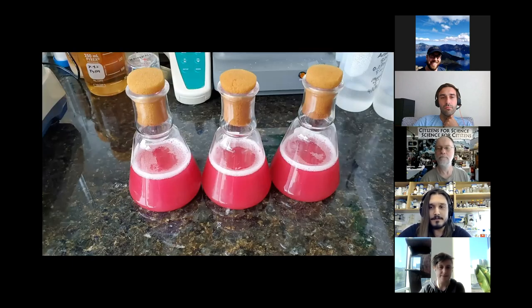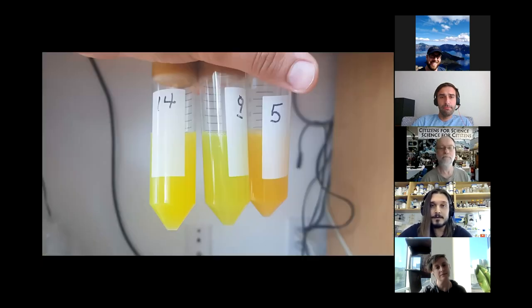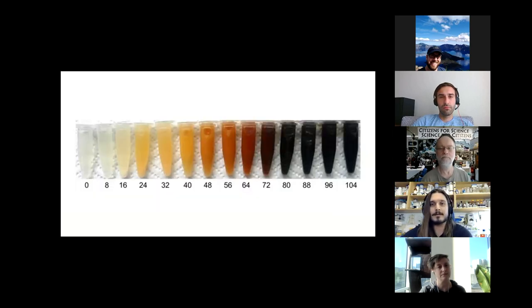So here's red. This is mRFP1, a monomer of DsRed from Discosoma, an anemone coral. And I was like, okay, this is beautiful. Let's try something else. Let's try yellow. Right. So after a bunch of manganese mutagenesis, I got some interesting yellows and I stuck with number 14. So we got a yellow, we got a cyanish, and we got a magenta. Cool. What about black? Right.